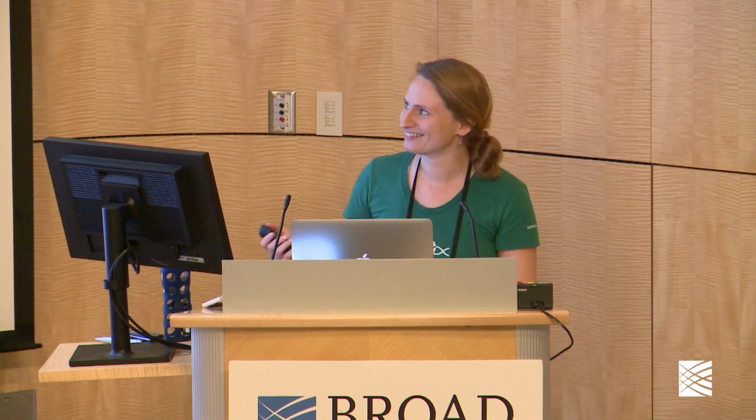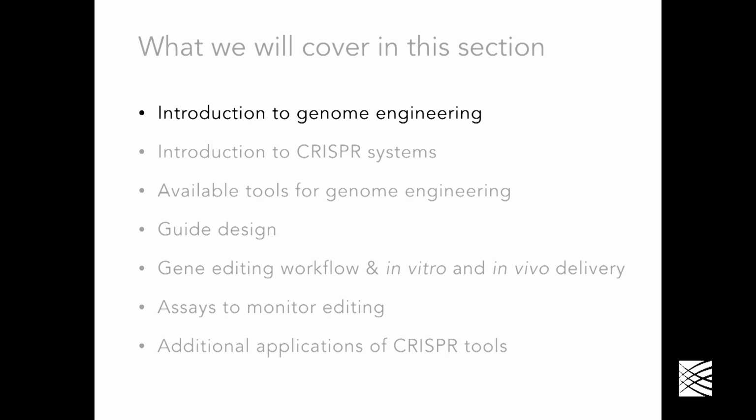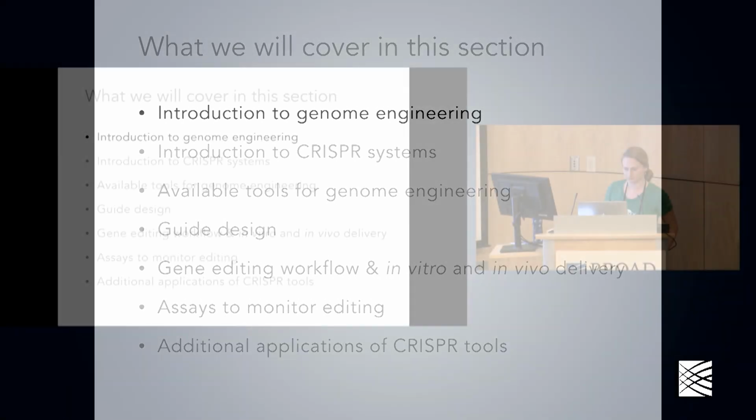So, let's begin. Here's what I plan on covering in this section today. First, I'll give a brief introduction into genome engineering, and then describe CRISPR systems. Next, I will give some examples of available tools for genome engineering, describe guide design, gene editing workflow, along with delivery, and then describe some assays to monitor editing. And then lastly, describe some additional applications of some CRISPR-Cas tools, as well as touch a little bit on HDR. So first, an introduction to genome engineering.